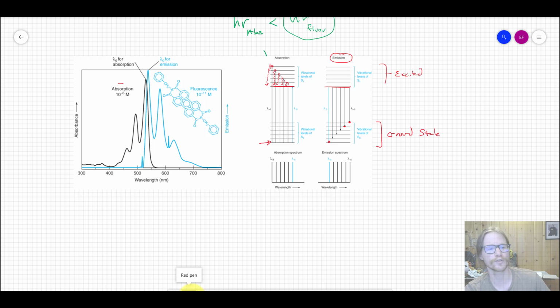And so if you were to overlay the absorbance spectrum and the fluorescence spectrum, you would end up with features that very similarly mirror each other, and that's because the vibrational levels mirror each other in the ground and the excited states, but you're seeing the opposite of that. You're seeing the emission of that versus the absorbance of that. And what's being shown here, normally you don't see these on the same spectrum. Normally you're recording absorbance or you're recording fluorescence because the geometry of the instrument's different. And so it's important to know that, but you could measure both.